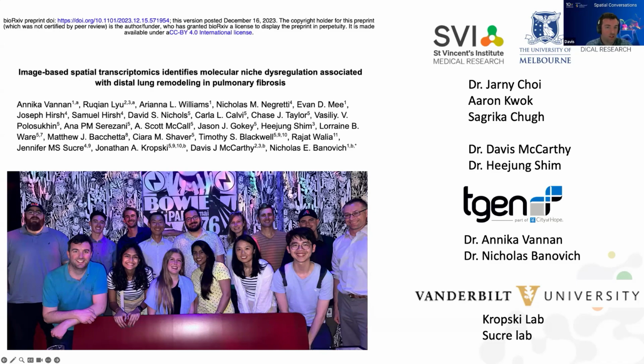They won't, as I can see, help with the intractable parts of cell segmentation, where we've got the challenges of transcripts assigned to the quote-unquote wrong cell because we've just had overlapping cells in tissue, and some are identified through whatever segmentation method, and some are just not. So I think they'll be part of the picture. I don't think there are any magic bullets, but we are certainly going to be looking at them seriously for our future analyses of this kind, because I think the more tools we have in the toolkit, the better.